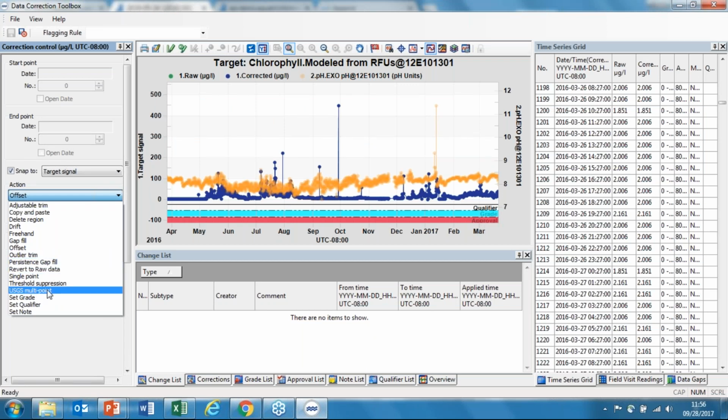The correction that Aquarius is using behind those auto corrections is this USGS multi-point correction. The multi-point is that ability, largely around pH, where we've got multiple standards and we're not correcting to a fixed value, but rather a curve of correction values. And we can apply that and any of the others that you see here on the list manually as well.